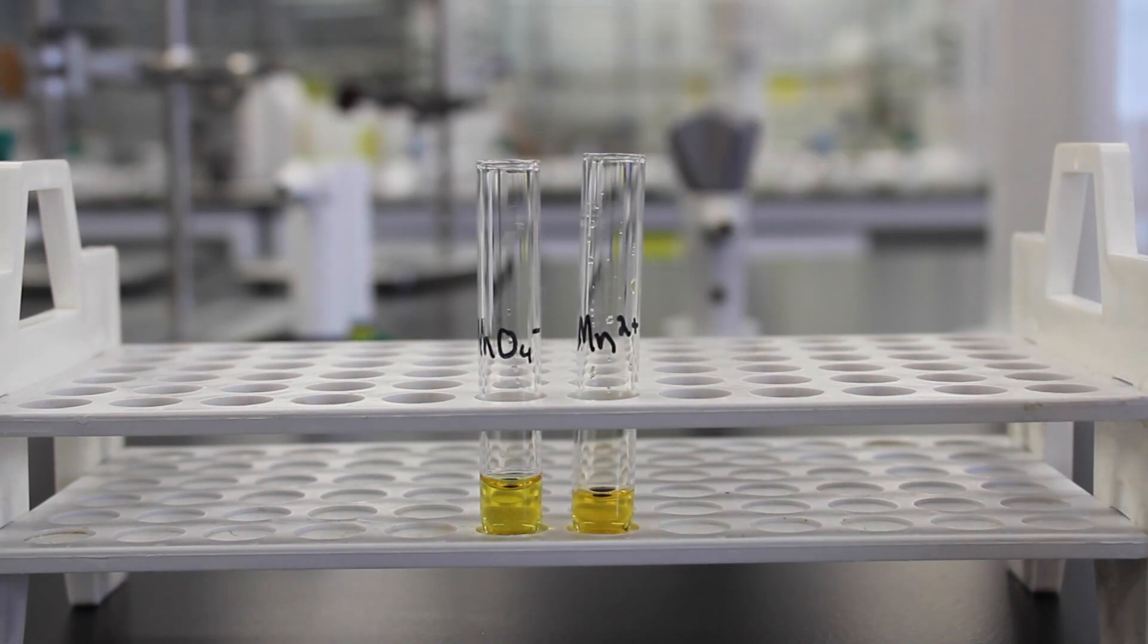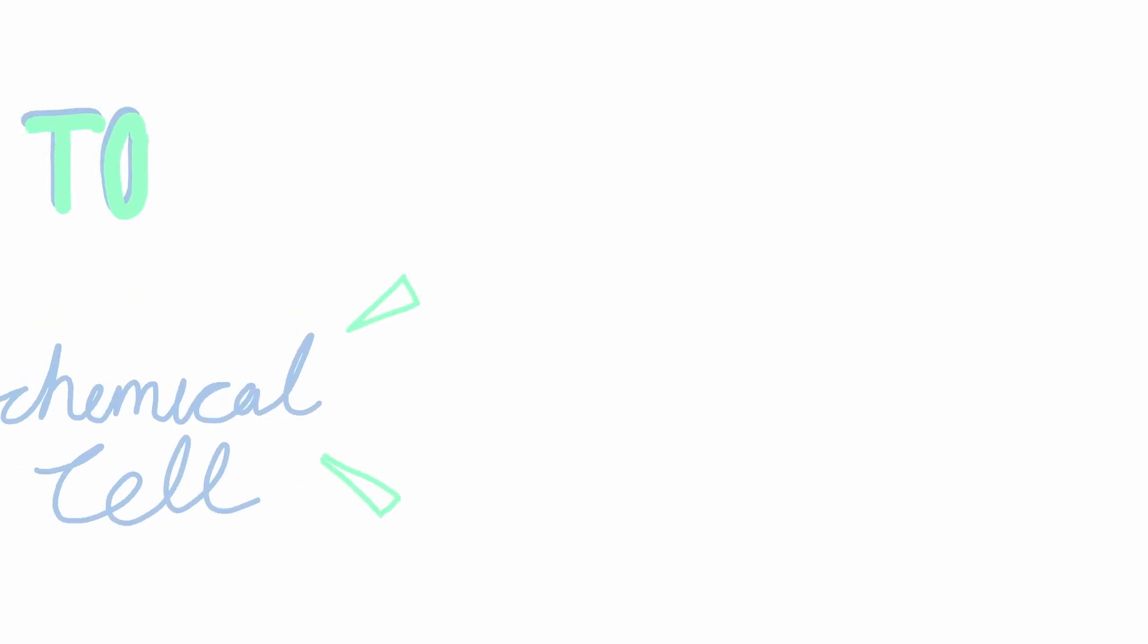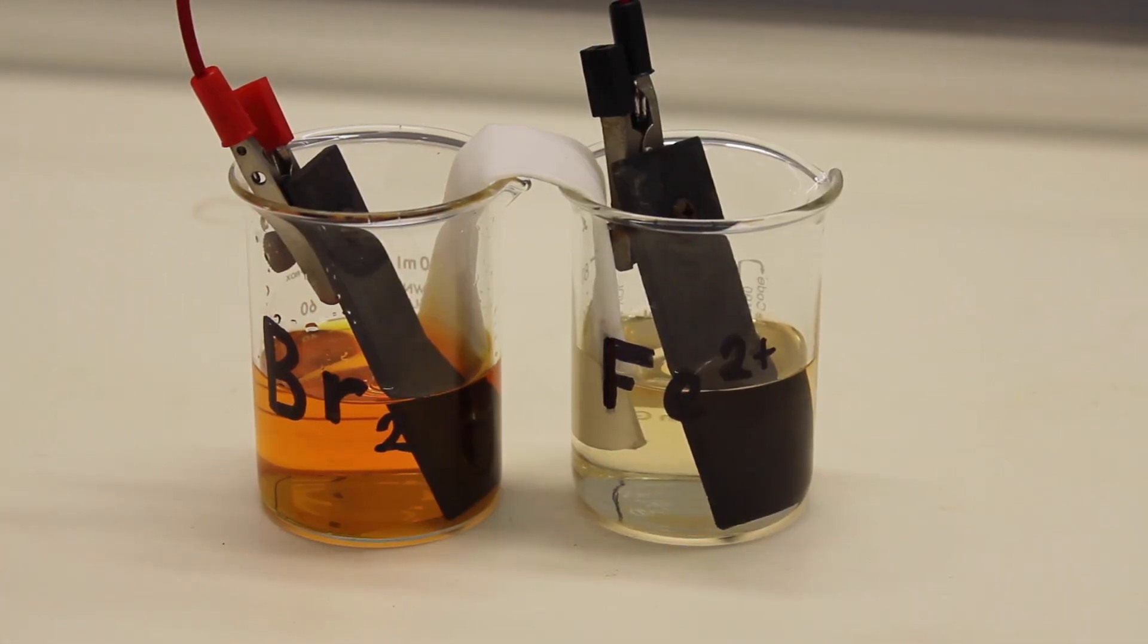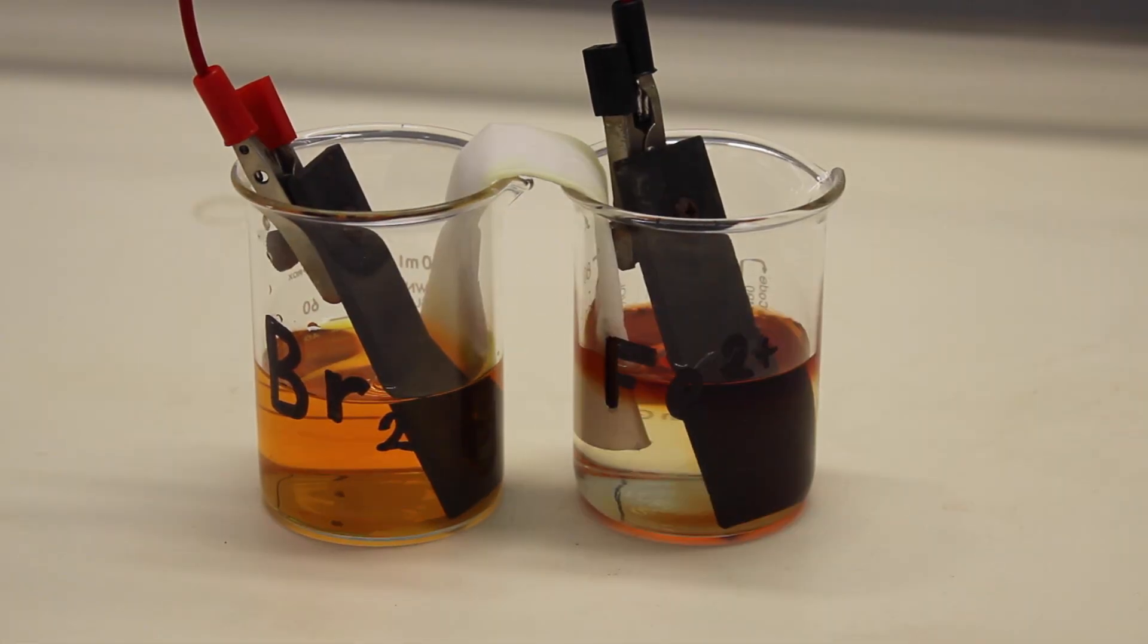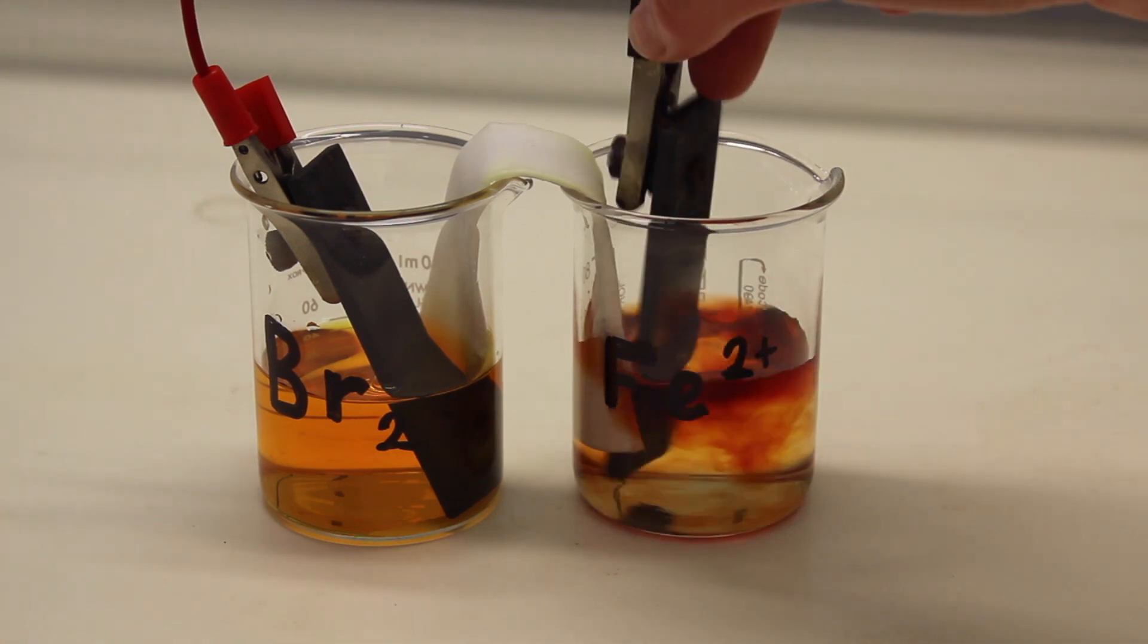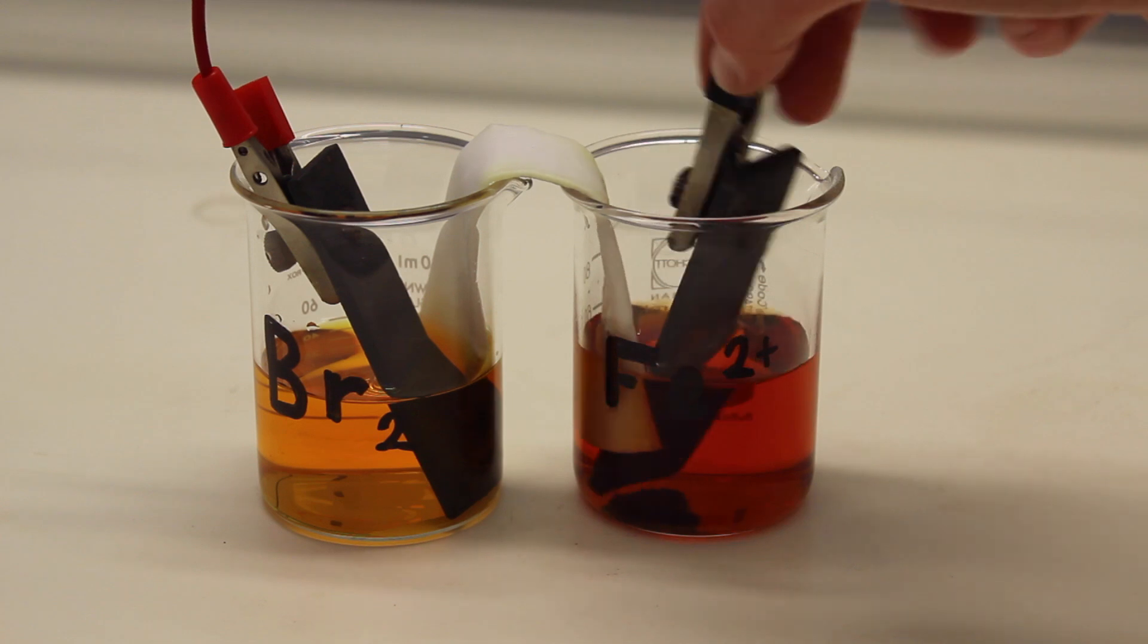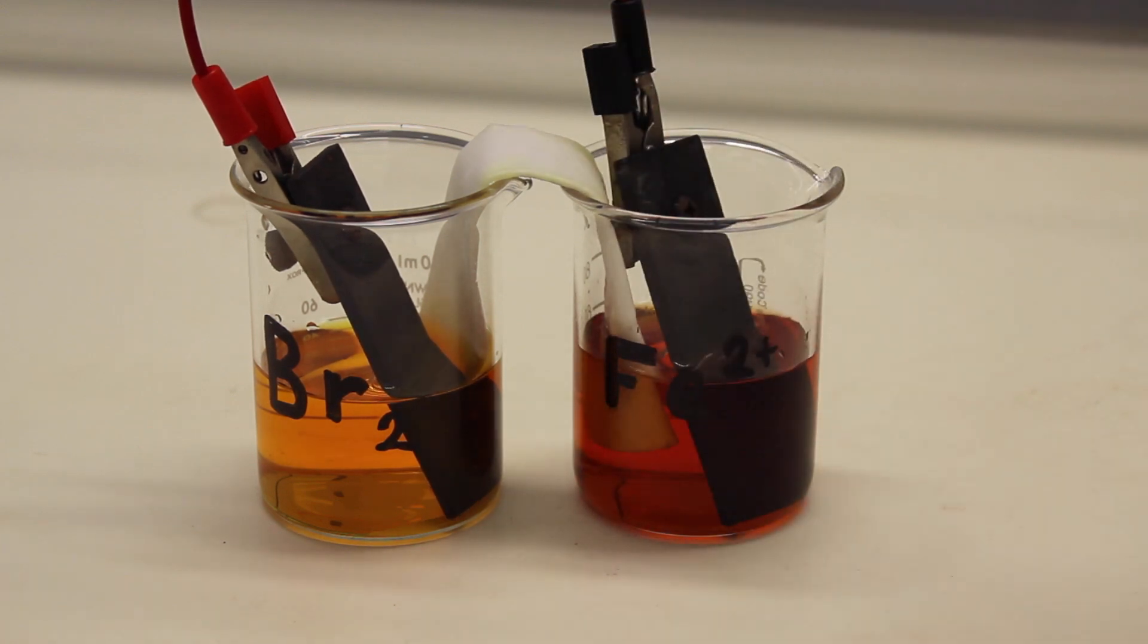You should now be able to rank all five of your couples against each other. Before we wrap up, let's go back to the fume hood and check on our electrochemical cell that we set up at the start of the lab. As you can see from the thiocyanate ions we added, iron 3+ has been formed in the right-hand beaker. This has been enabled by the ion bridge and the copper wire, allowing electrons to flow between the two solutions.